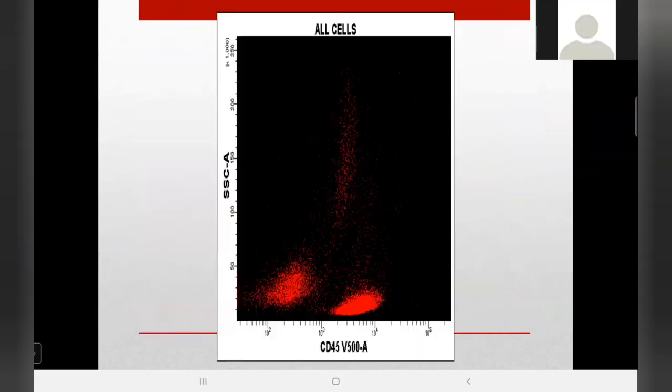When we put up a flow, we surprisingly saw that the entire population divided into two. This is a CD45 positive, and there was a dimmer population, like such a dim population of 45. So we got really perplexed. I mean, like we had just put up a 45, then we put the entire panel. So can anybody, like based on this, tell me what is happening in the patient? Ma'am, the patient is getting both B and T and diffuse large B-cell lymphoma. Okay.